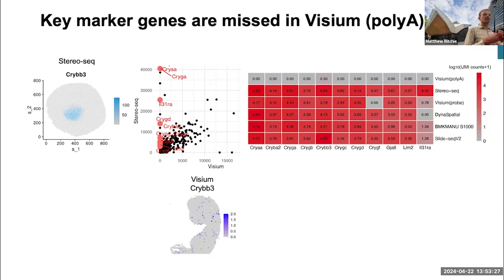So I guess that again suggests the way 10x is going towards probes, and there's maybe a good reason for that, because you can really focus in on regions and not run the risk of missing particular genes in regions of interest altogether.